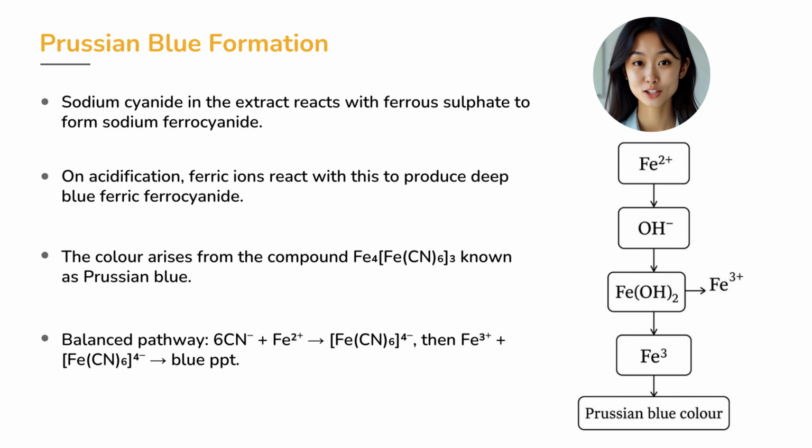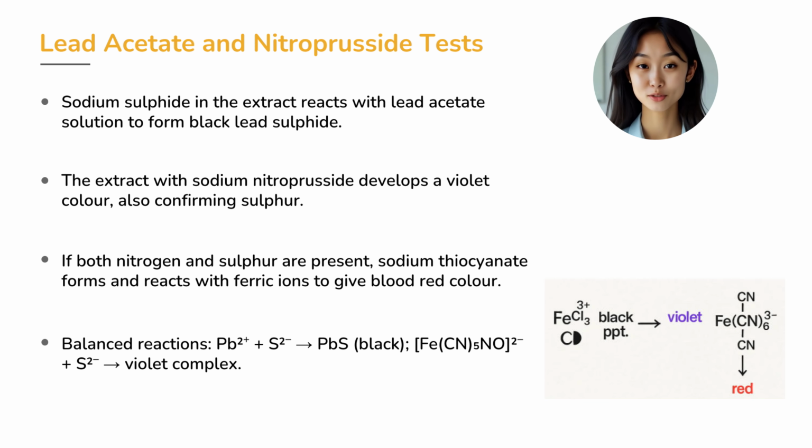That striking blue color is a confirmatory test for nitrogen. But here's the catch: the acidification step is crucial. If you forget to add acid, the brilliant blue will never appear, and you may wrongly conclude that nitrogen is absent.